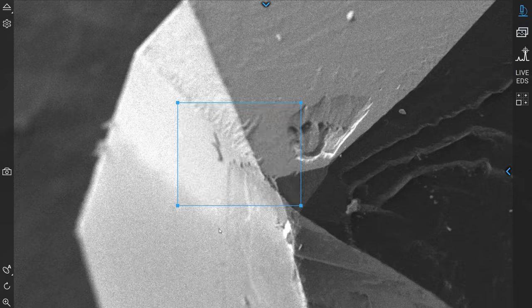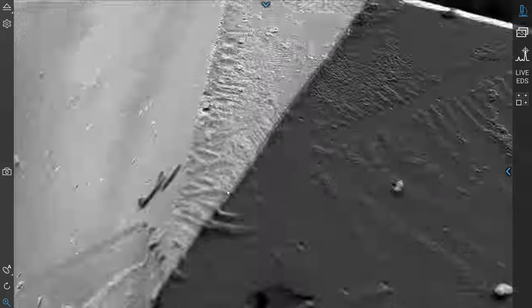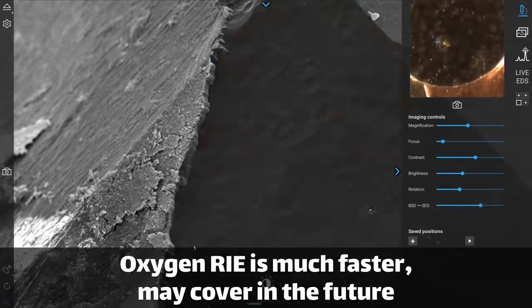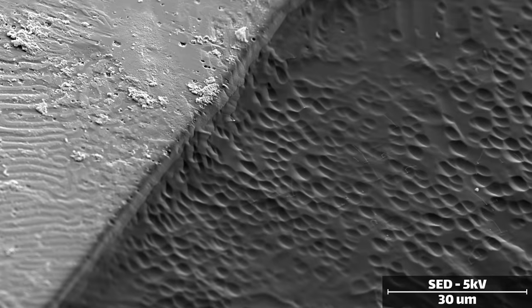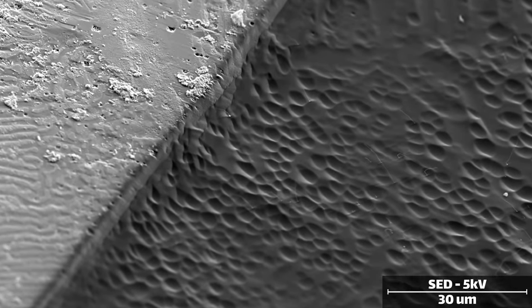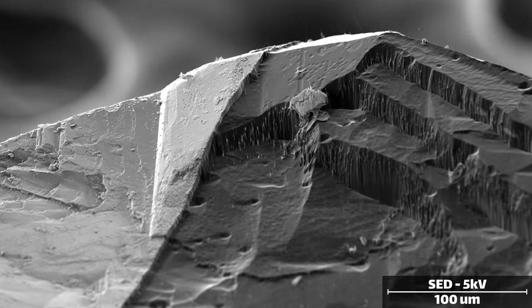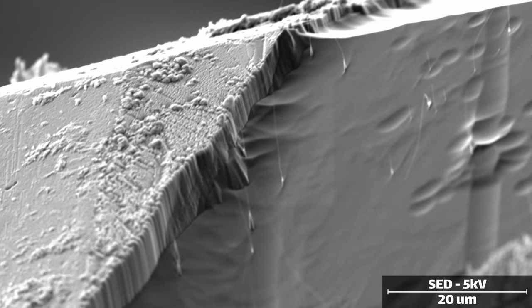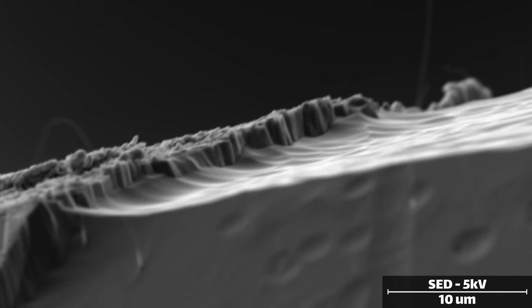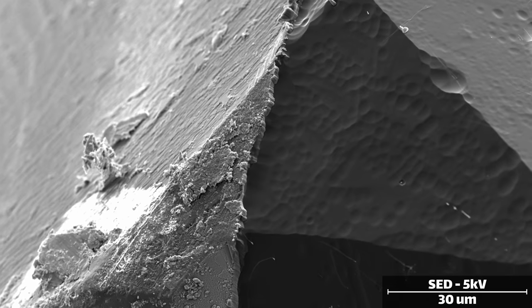I took one of these little diamond particles and etched it with the mask in place for a couple hours. And if we look at it under the microscope, we can see there is definitely an etch line there. Considering how long it was under the beam, and that we only etched a few microns, it's a very slow process, but we definitely etched the diamond. Which is honestly pretty amazing if you think about it. Diamond is typically ground and polished with other diamonds. That ends up being extremely slow and very expensive because your abrasive wears out at the same rate as the thing you're trying to abrade. In contrast, an ion mill slams individual argon gas particles into the diamond at such high speeds that it knocks carbon atoms free. It's kind of remarkable when you think about it. It truly is an atomic sand blaster capable of etching any material.